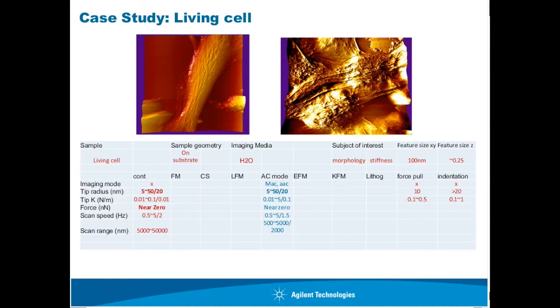By just looking at the physical shape, you probably cannot tell the difference. What I suggest, to differentiate two different types of roughness, is to take a look at other physical properties. For example, stiffness. For example, adhesion. For example, electrical property.